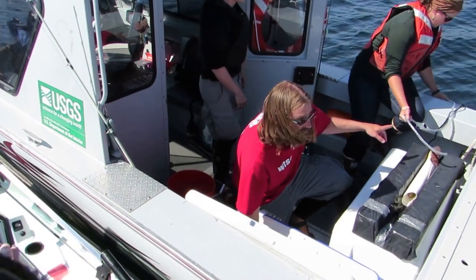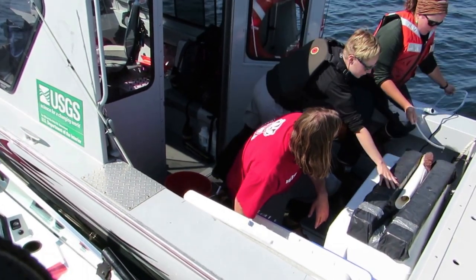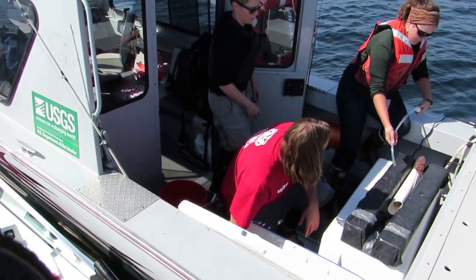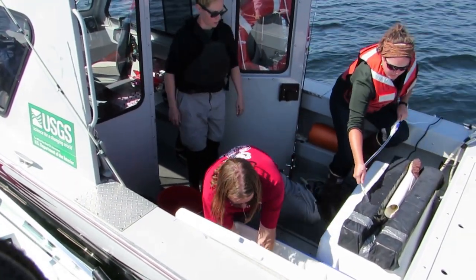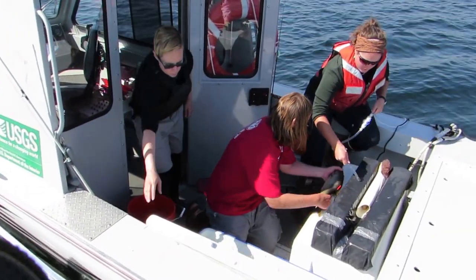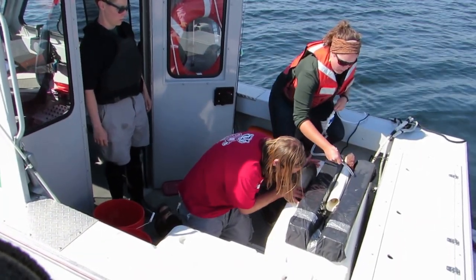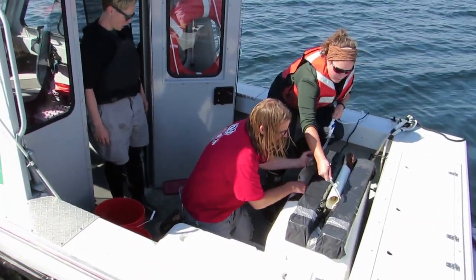Once I take this fish out, Carla's going to put this tube here with water running in it, and we'll take a measurement on it. A.J., I'm going to take the fish out — fish out. We've got a total length of 20 inches.